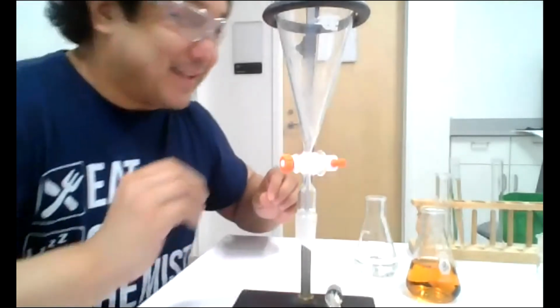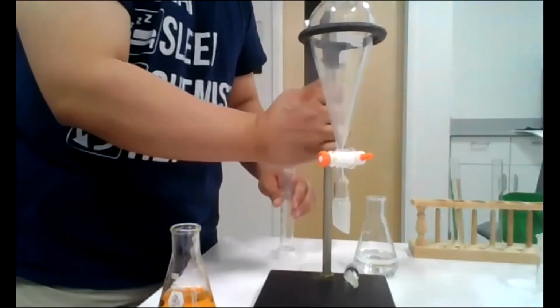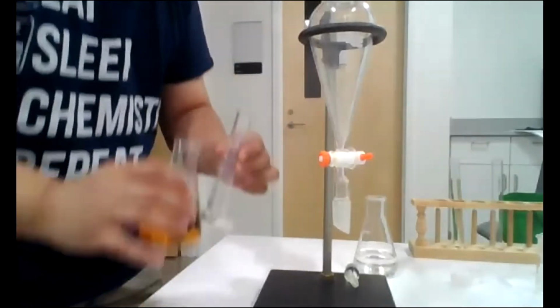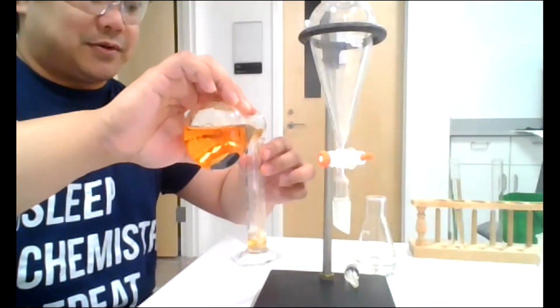Oh, I'm making a mess. Okay, here's my separatory funnel here, a new one. And here's my graduated cylinder. Again, same. We're not going to change the variable of how much iodine solution we're using. We're still going to use 20.